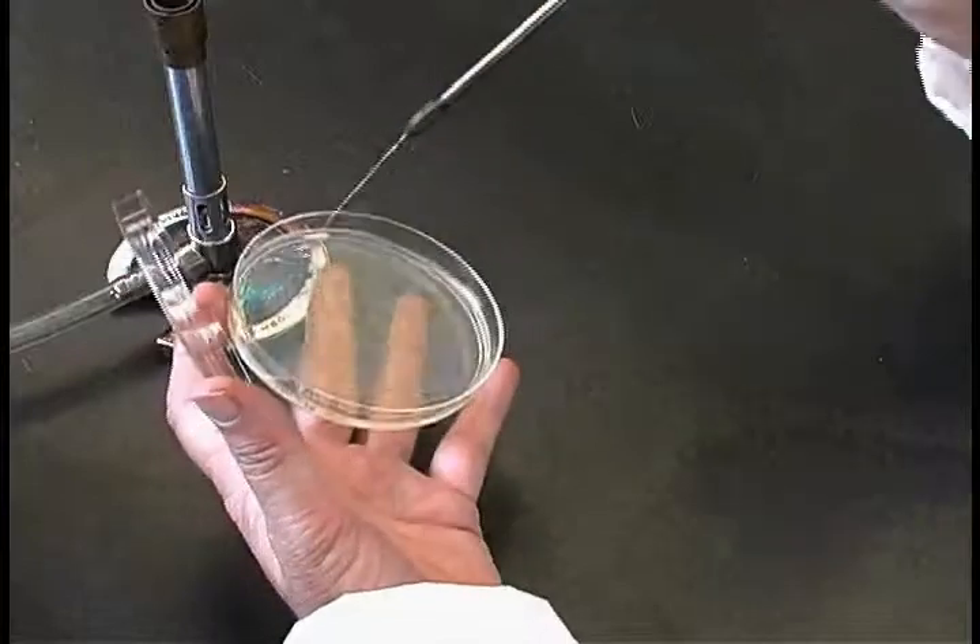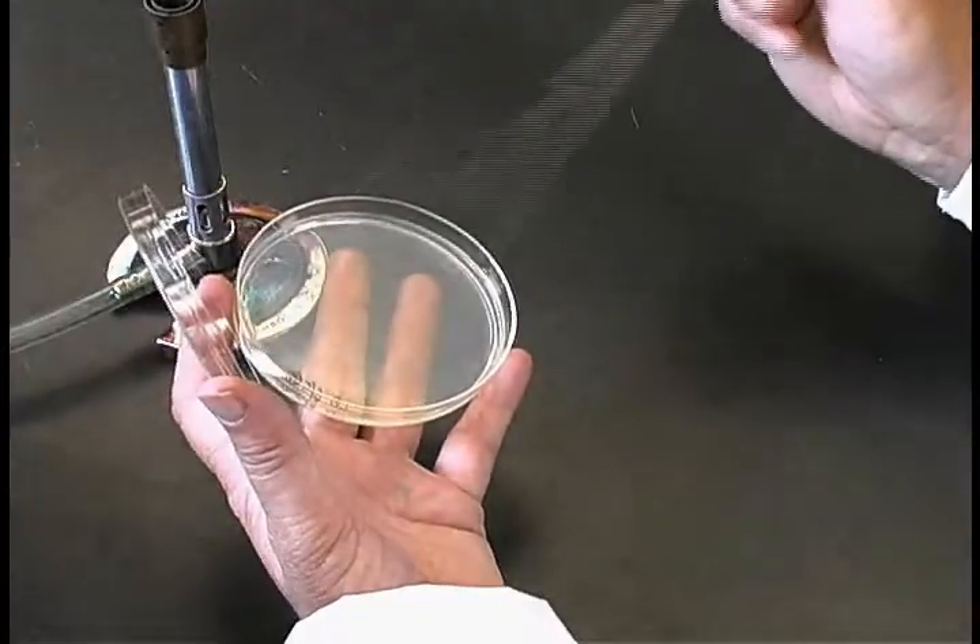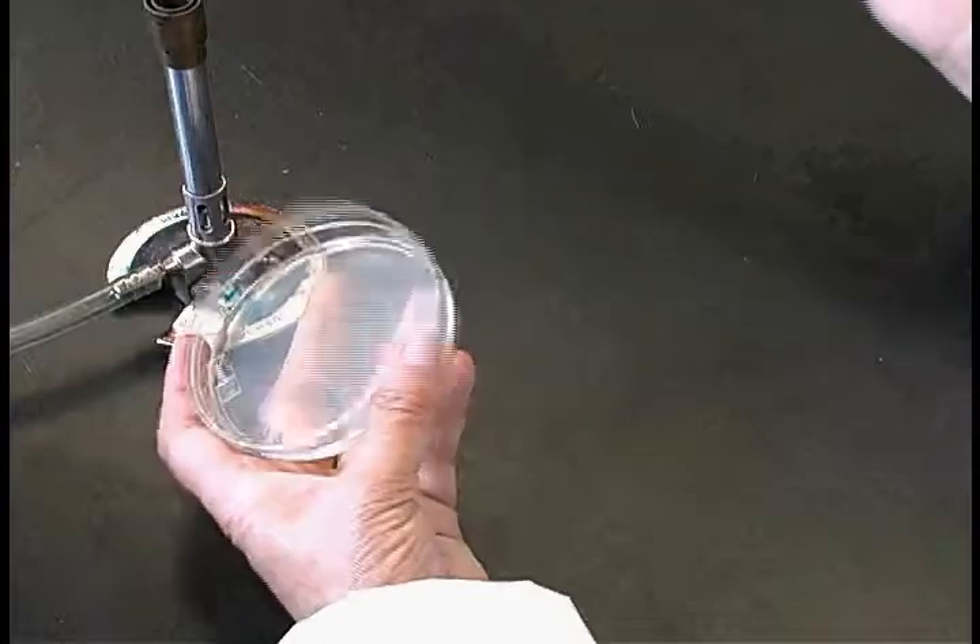Spread the bacteria on the surface of the plate starting from one edge. Use your fingers to move the loop.